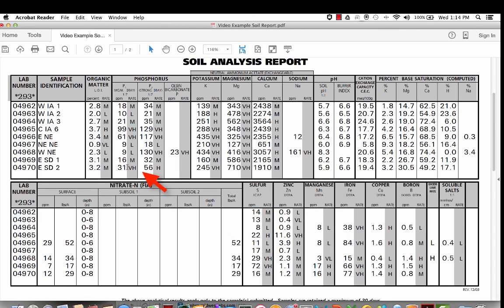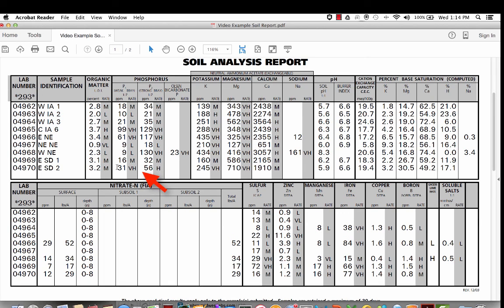And then this last sample, the eastern South Dakota sample number 2, comes with really good fertility, a 31 on the P1 Bray, a 56 behind it, which is showing about that 1:2 ratio we were talking about earlier. So in this sample, we're probably just going to replace a portion of crop removal or maybe even make no recommendation, again, depending on what that grower's yield goals are. If he's got more aggressive yield goals, pushing for higher yield, we'll go ahead and keep making some recommendations into these low 30 numbers.